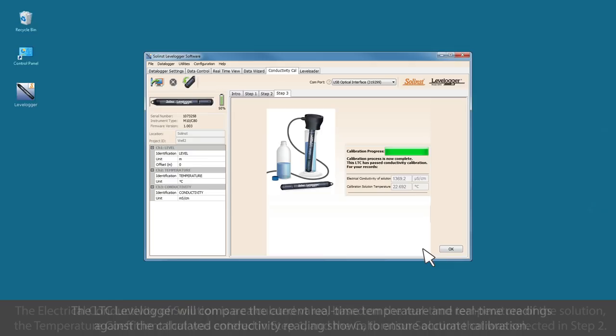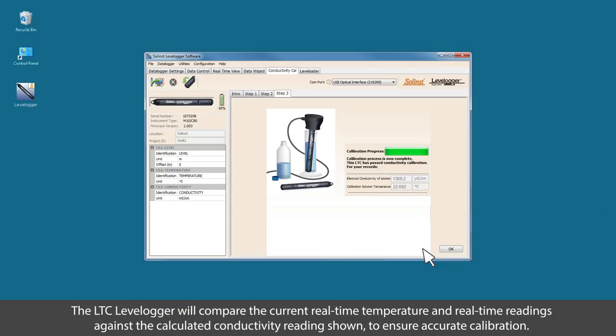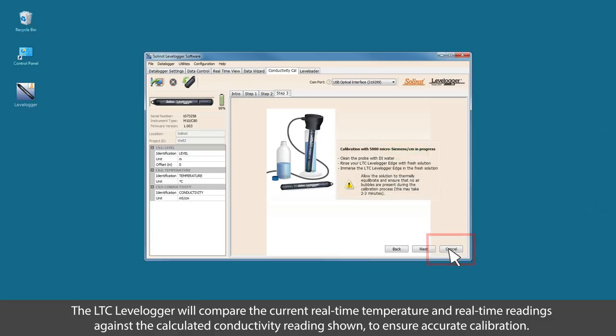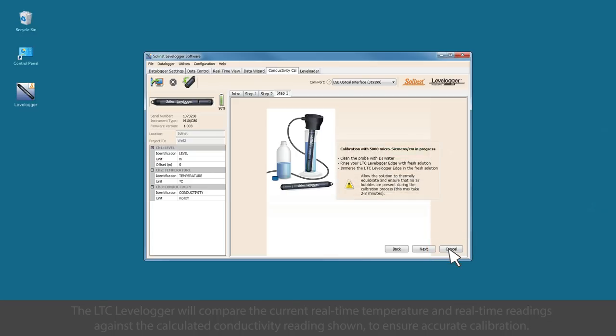The LTC Level Logger will compare the current real-time temperature and real-time readings against the calculated conductivity readings shown to ensure accurate calibration. This logger has passed its first calibration point.